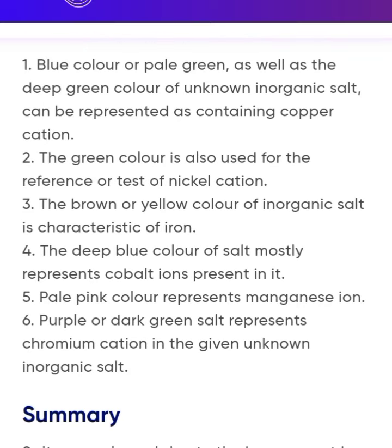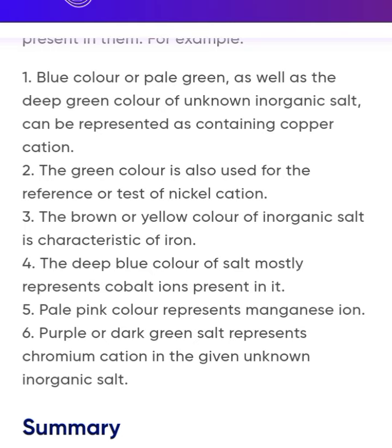You can see some of the things we use this color for. We use it to identify a particular ion that might be present in the solution. For example, if we have a blue color or pale green, as well as a deep green color in an unknown inorganic salt, you may say, okay, copper cation might be suspected until you confirm it.